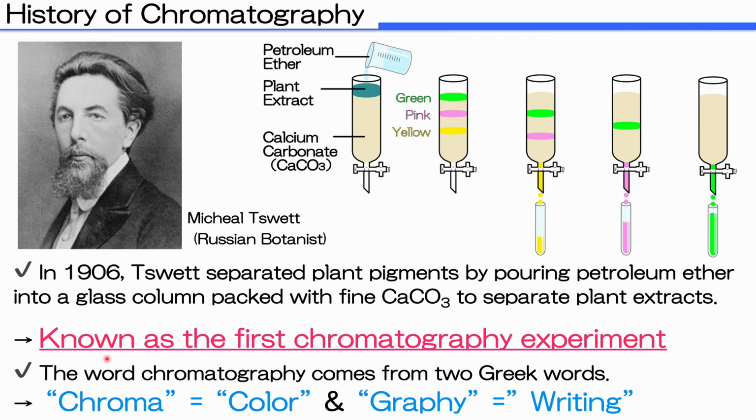This is known as the world's first chromatographic experiment. And the word chromatography comes from two Greek words. Chroma, this means color, and graphy, this means writing.